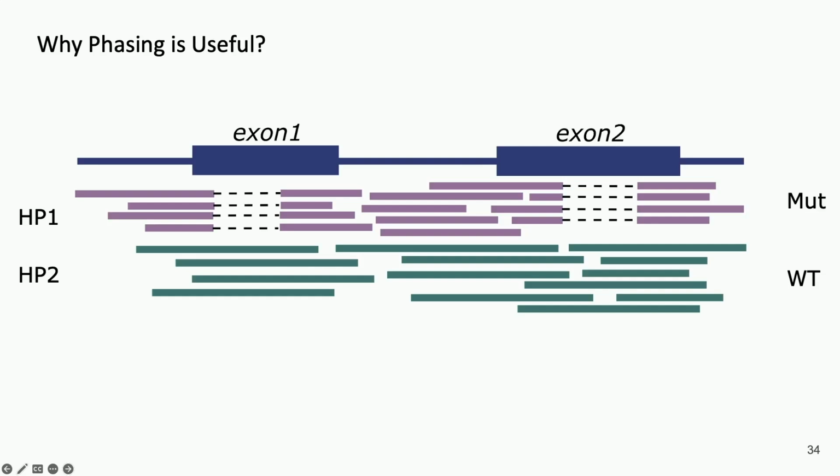The additional layer of information that we can get from here is that all the reads in haplotype 1 support this deletion. That means it's probably a clonal event, meaning all the cells in your sample have this deletion. In other words, if we had multiple reads spanning through in haplotype 1, you could say some portion of the cells has this deletion, some hasn't.